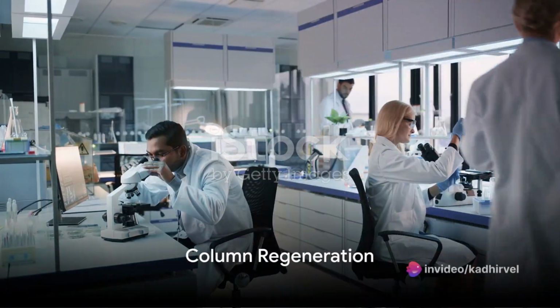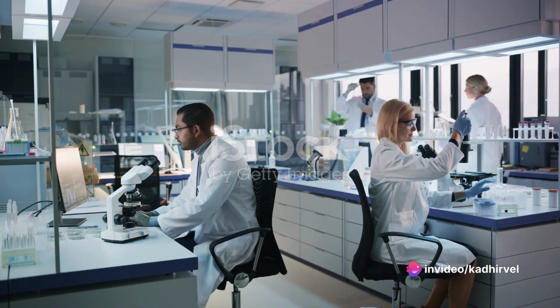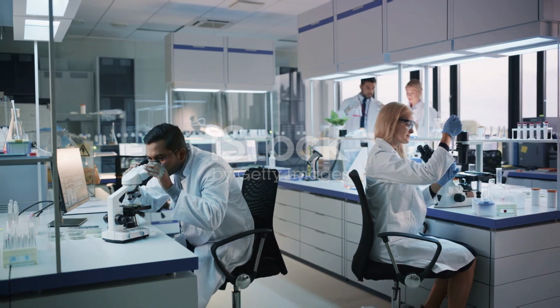Finally, there's column regeneration. This process is critical for maintaining column performance and longevity. Proper regeneration procedures help remove contaminants and restore column functionality.